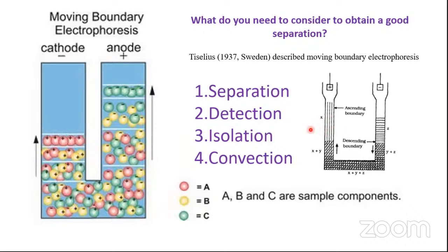So is it not an important problem that you are going to face after the electrophoresis is done? Unless you are using it only for analytical purposes, that too is not going to be a very precise separation. But still, you will arrive at some point where you have got X separated from, say, the rest of the two components. But essentially, there will be a problem that you cannot isolate X from the rest of the components. And as we have already discussed, there is no complete separation.